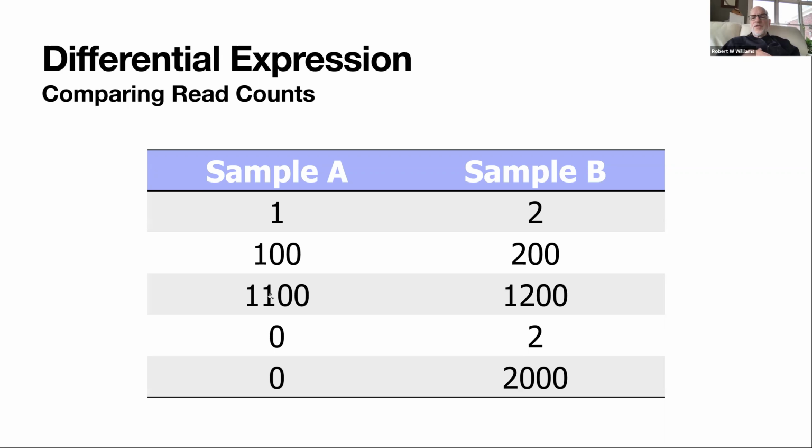Laura, a question from David that I think we might want to handle right now. He asks, is RUV-seq or the equivalent still possible if you don't have a binary phenotype or binary categorization of samples?